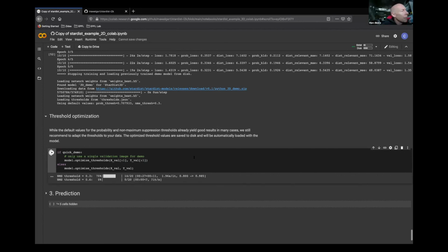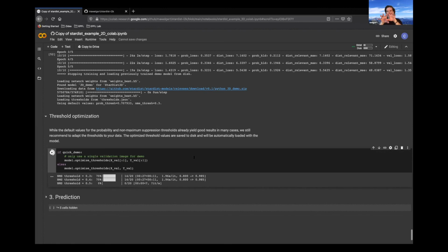But Martin? Yes. So we discussed before that we don't use overlapping nuclei for the training. So it hasn't seen overlapping nuclei. So how does it evaluate this threshold? Yeah, this is the overlap for the NMS, so for the rejection of polygon candidates. Because sometimes you want to allow close-by nuclei that are still touching, but the objects that are predicted are overlapping a little bit before you render them to the final image.